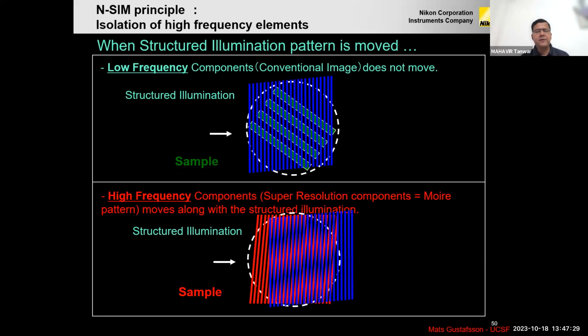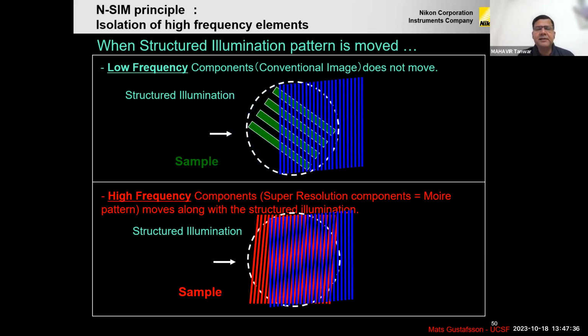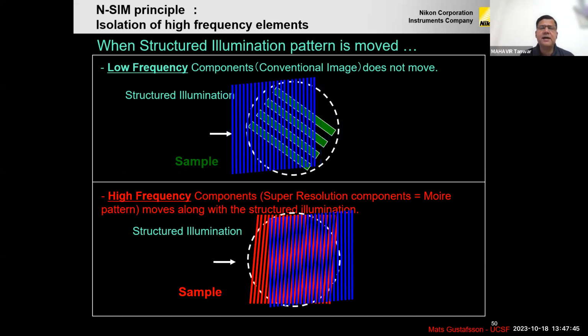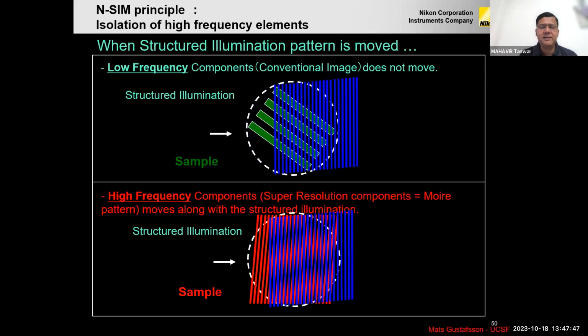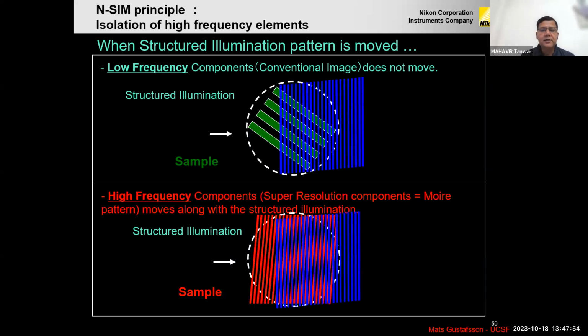So now how does it work? Let's say in the first example, it's a sample, nothing is happening. At the back, there is a sample frequency, and at the top, the known frequency, which is positioned by us. It's a structured illumination, SIM frequency. Nothing is happening, so this sample may not have high resolution information. But in the lower image, can you see these waves? Yeah, so it has a very high frequency. The backside is the sample and the front is the SIM frequency.